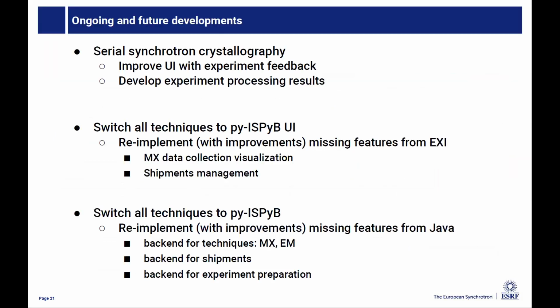For the future development, we need to improve the serial crystallography implementation because this is still a work in progress. And we need to switch all the existing techniques from the previous ISPyB UI to the new one, and same for the backend.